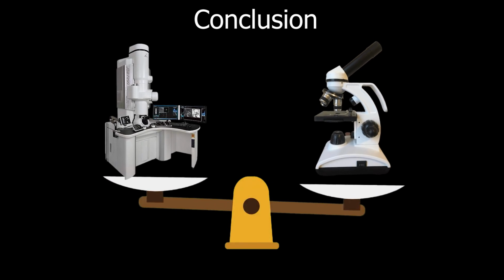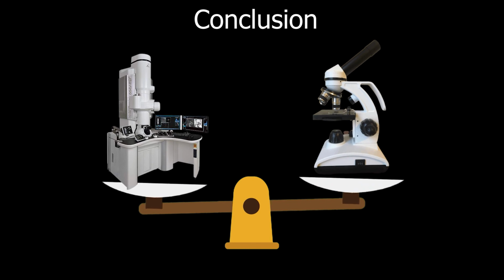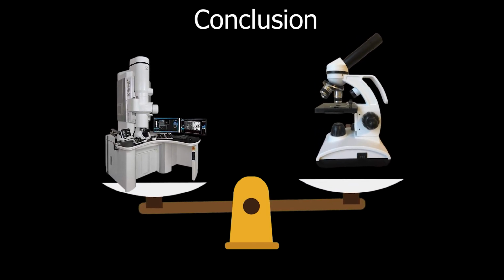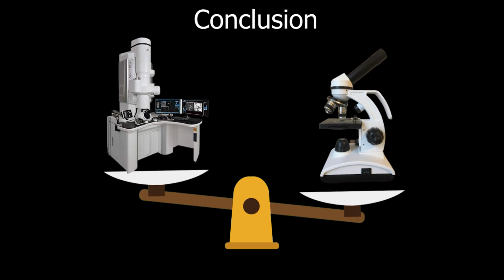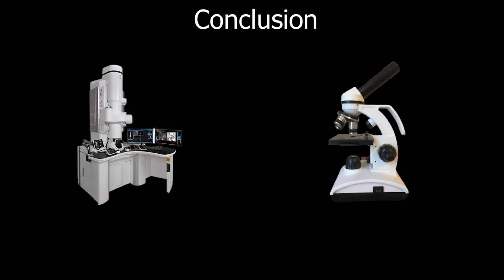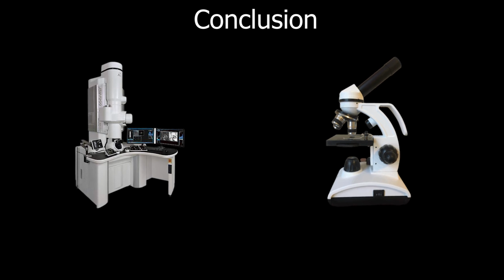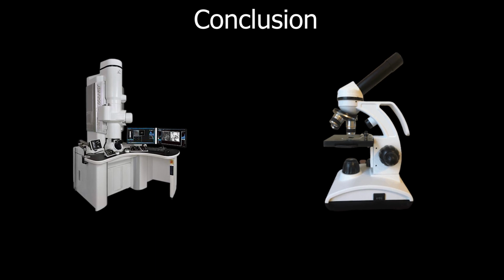But CLM isn't necessarily less useful than TEM, the same way that TEM does not automatically mean better than CLM. The keywords here are practical and appropriate. Each microscope is designed for specific tasks, and it all lies to the researcher themselves to know when and how to use them. Like in the real world, the secret to taking good pictures does not lie within your phone alone, but within your subject and your skills as a photographer.